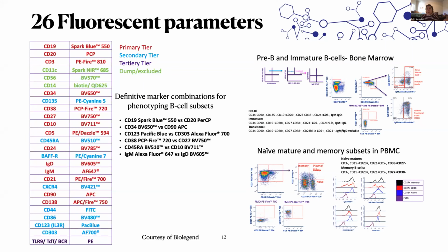spectrum. Post-COVID, it's going to be the age of vaccine memory. So this same sort of concept, but also for T cells, is going to be everything. We need to see all of them simultaneously. To only have snippets of them and then have to do a lot of parallel assays is not helpful, because you introduce a ton of error and you have too many variables when you start bringing it up into parallel panels.